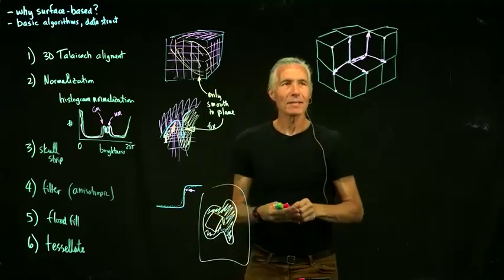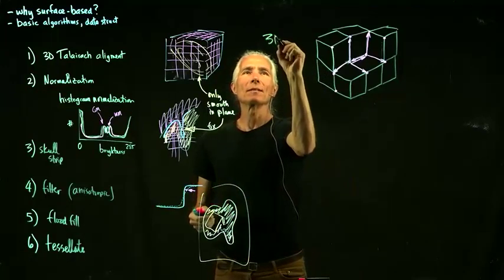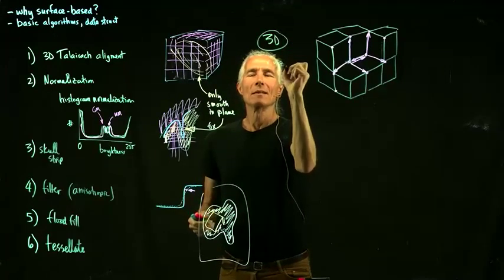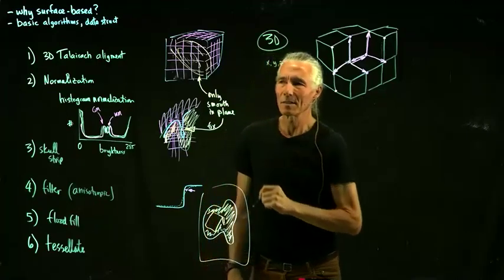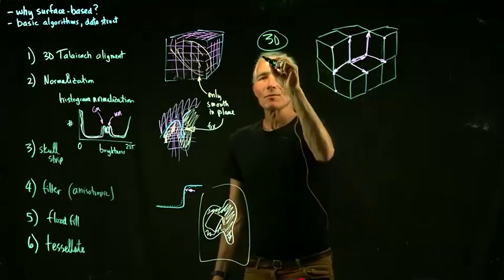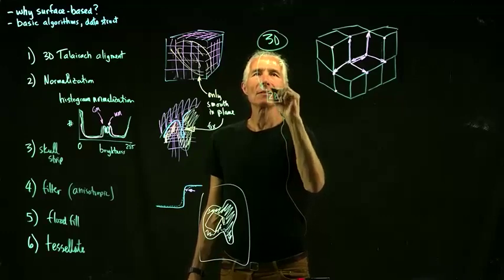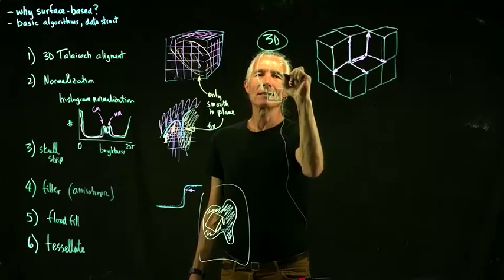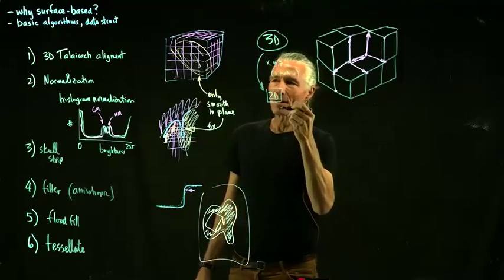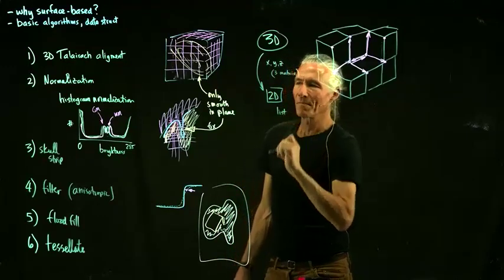Now, the thing about that is, initially we were starting off with a 3D coordinate system, which was basically just x, y, z. So each voxel just has an x, y, z position, and it's relatively straightforward. What we're transitioning to is a different kind of coordinate system. So this was just a simple 3D matrix, but this is no longer a matrix. It's actually a list.